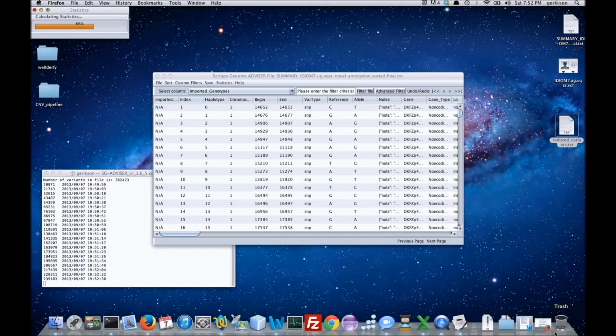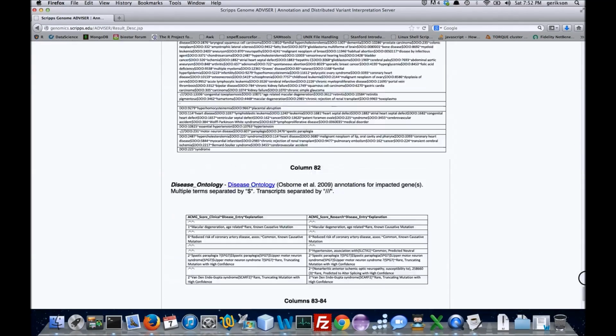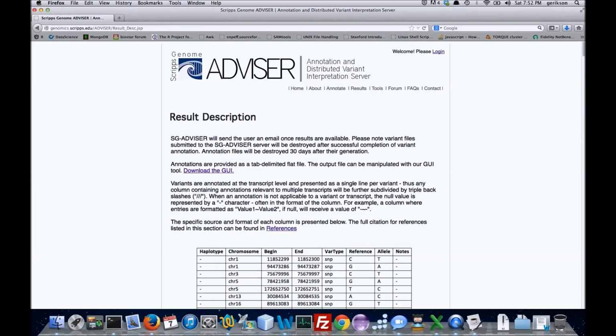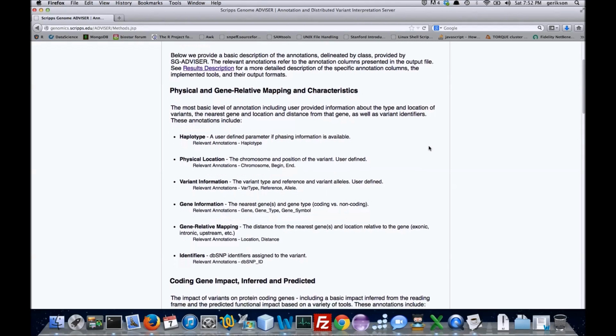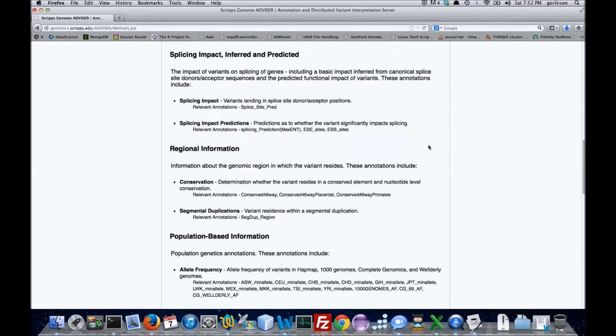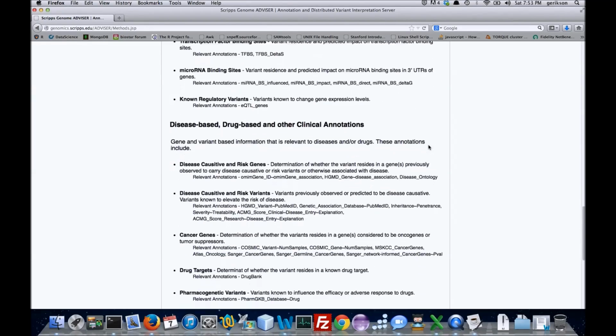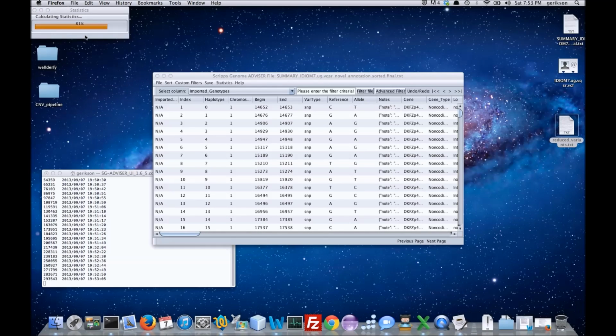There is 66%. Methods we used. 19% left.